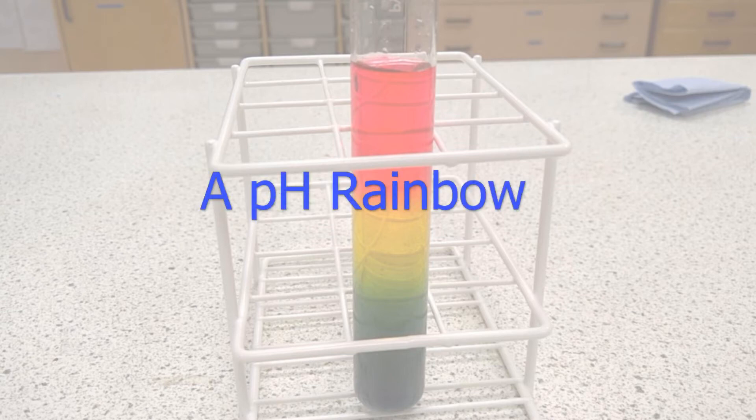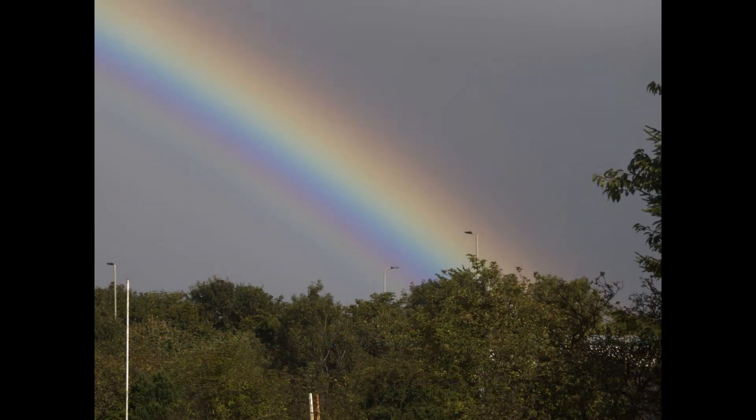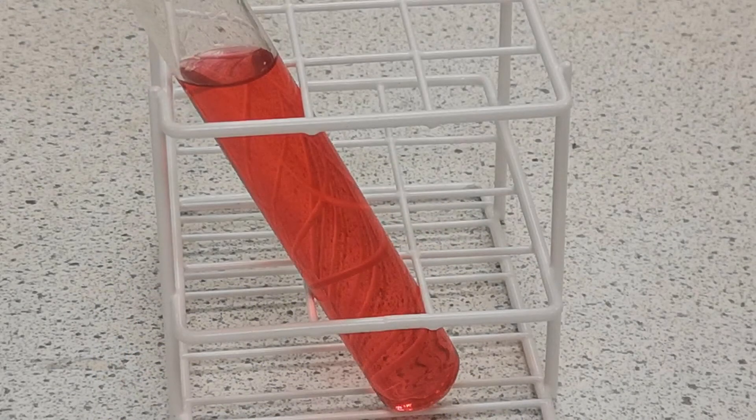The pH rainbow is a classic experiment to show the colours of Universal Indicator. It works by establishing a pH gradient in the tube so that there is a different pH at different points, shown by the colour of the indicator. There are various methods of carrying this out, but this one is, I think, the easiest.